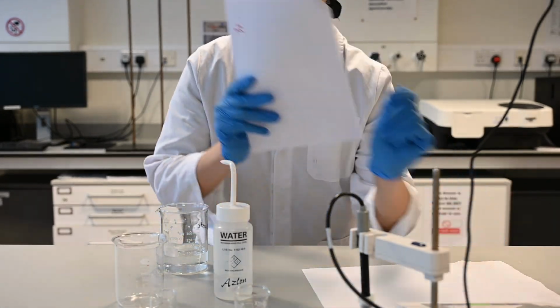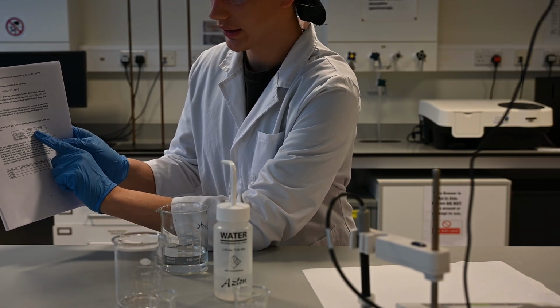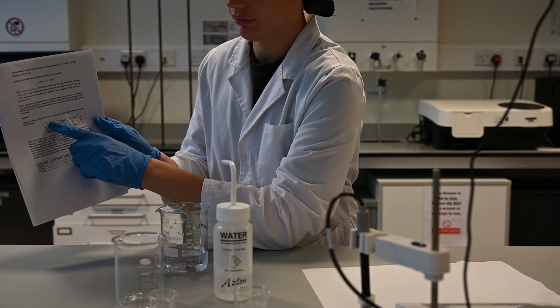I'm kind of left to my own devices, and I'm going to continue showing you guys how to do this experiment. We're going to be needing to make two things: the blood solution and the water solution. The blood solution is going to hopefully represent what our blood in our actual body is, and the water solution is going to represent what our blood is without these two components.